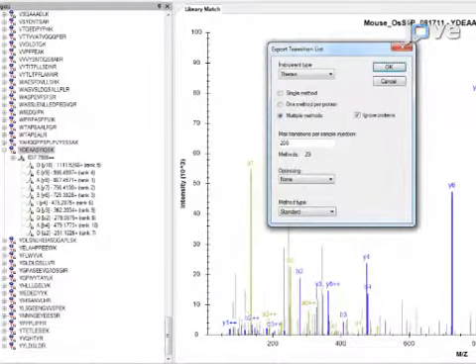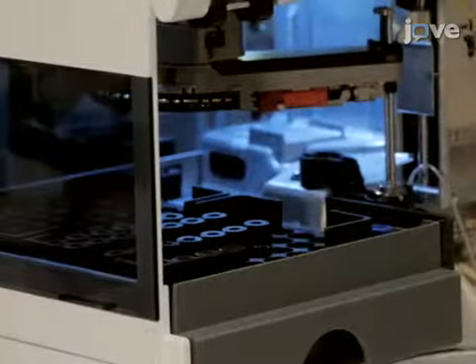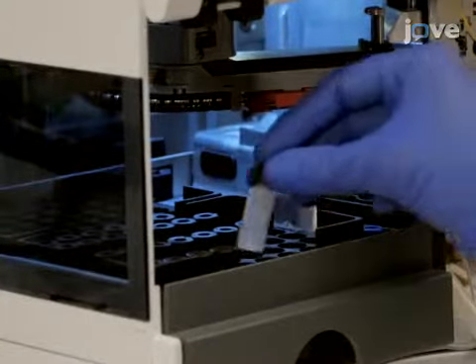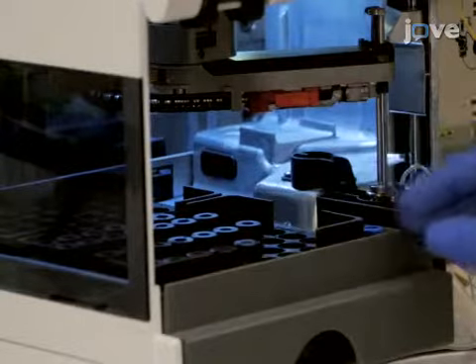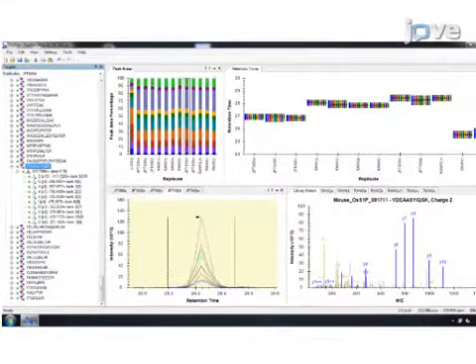Prepare an LC-SRM transition list using the 3 to 10 most intense transitions per precursor ion. Use the resulting transition lists to perform LC-SRM analysis of the mixtures of the external peptide standards. Manually review the resulting LC-SRM data and delete any poorly performing assays.